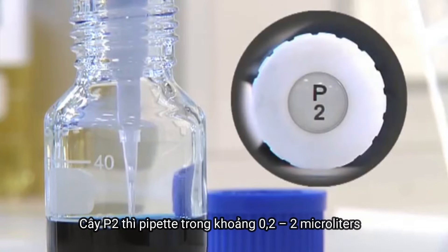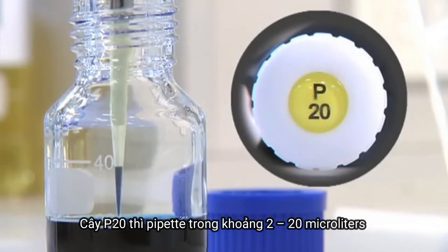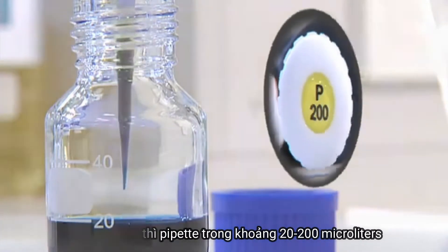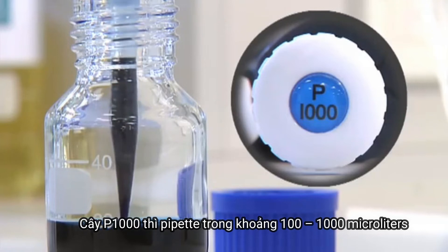A P2 pipettes between 0.2 and 2 microlitres. A P20 pipettes between 2 and 20 microlitres. A P200 pipettes between 20 and 200 microlitres, and a P1000 pipettes between 100 and 1,000 microlitres.